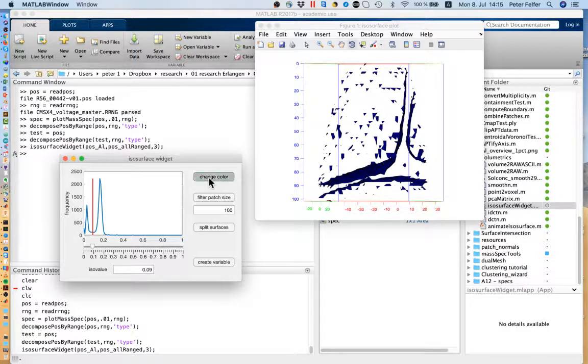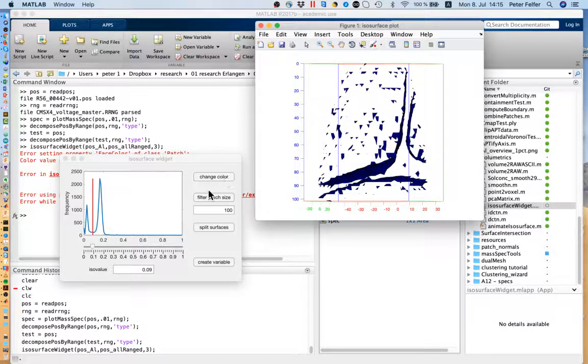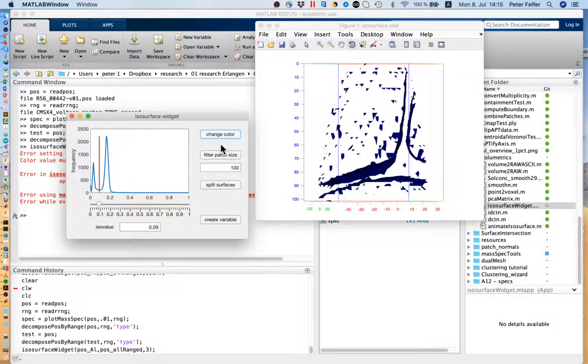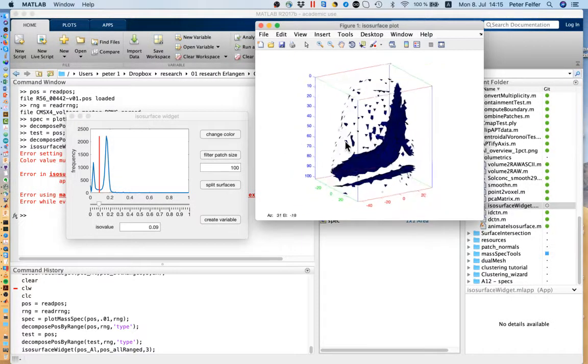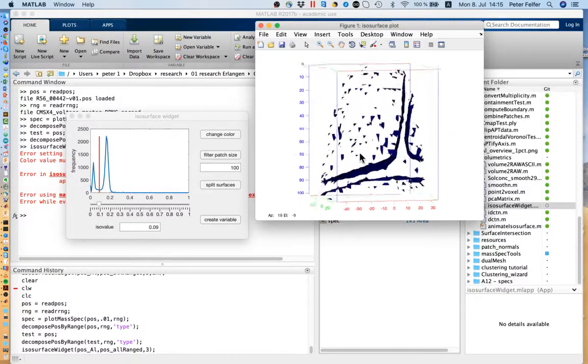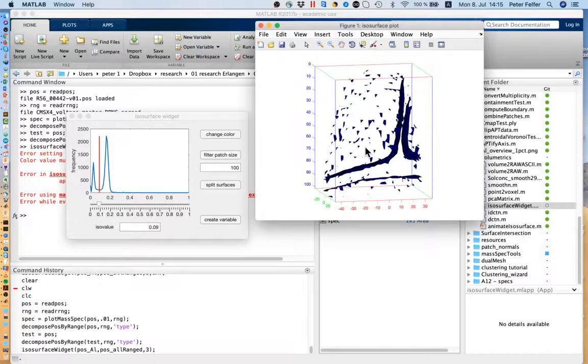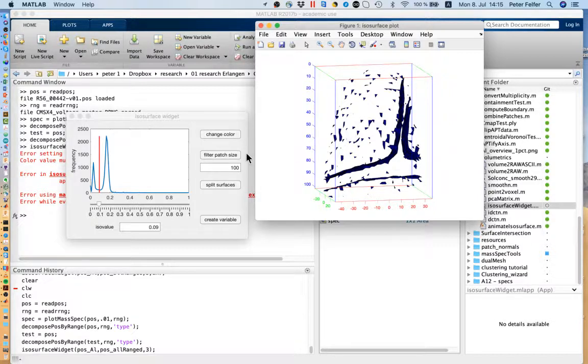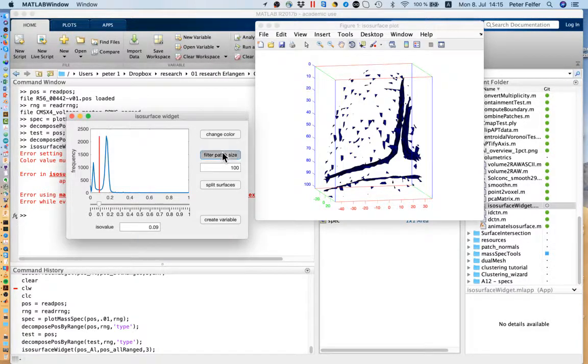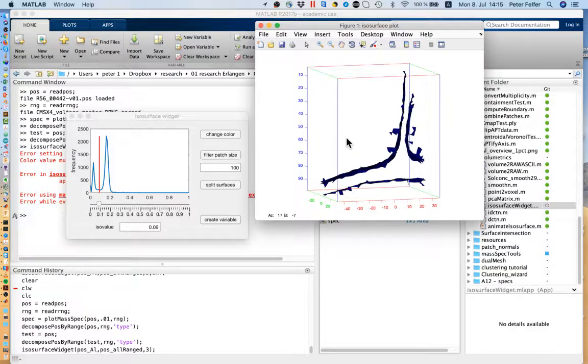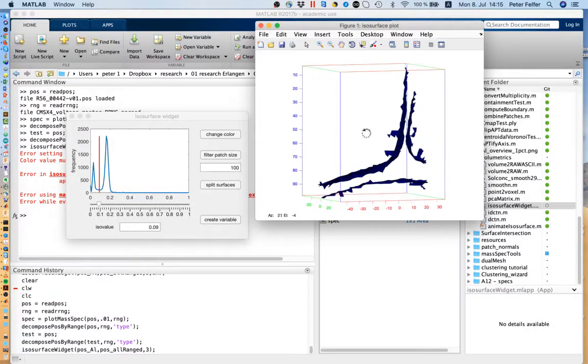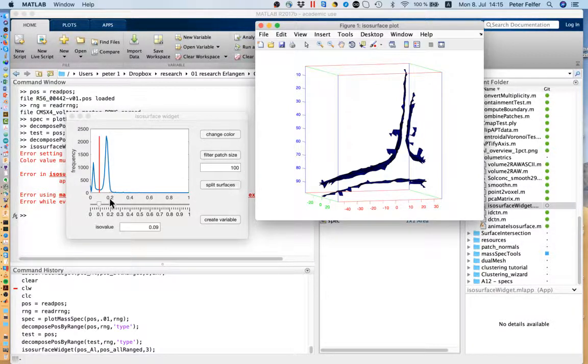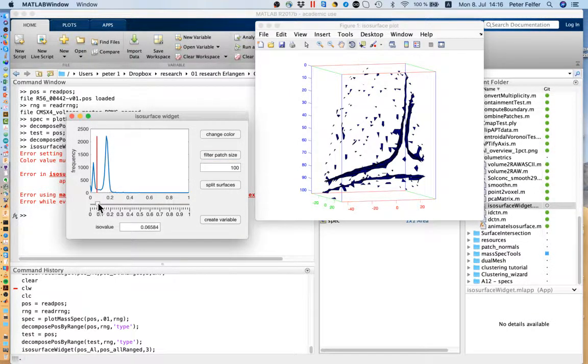Next thing you can do is change the color. The next thing is actually pretty important: filter patch size. What you see here is that we've got a lot of loose parts of isosurface floating around due to counting statistics, a lot of those near the surface. What we can do is filter any of those patches that are smaller than 100 vertices, so smaller than 100 corner points making up the patch. If we do that, you can see we only end up with the three big ones. Of course you might want to change that depending on how small precipitates or whatever you have in there. Sometimes 100 filter size can be a little bit too large. Any time you drag the slider it will re-update.